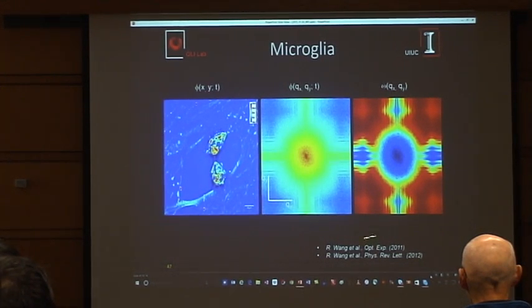So a few years ago, we came up with an idea that relies on calculating a dispersion relation, the same way we use it all the time in optics. Dispersion relation in vacuum means that spatial frequency k is linear with omega, so temporal and spatial frequencies are related. We did the same thing here.